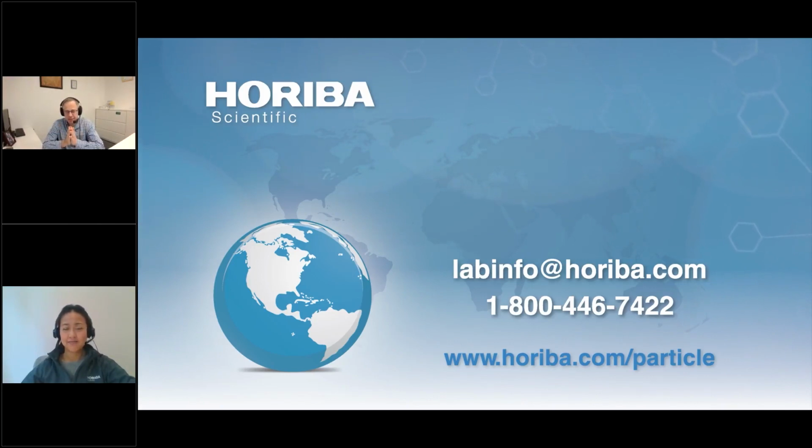Dynamic light scattering, and the instrument, relies on two things primarily, and I'll say a third thing important enough that I better mention it. The first is the geometry of the instrument, which gets you your scattering vector. And the second is the timing inside the signal processing electronics and the autocorrelation function. And those are very, very stable.